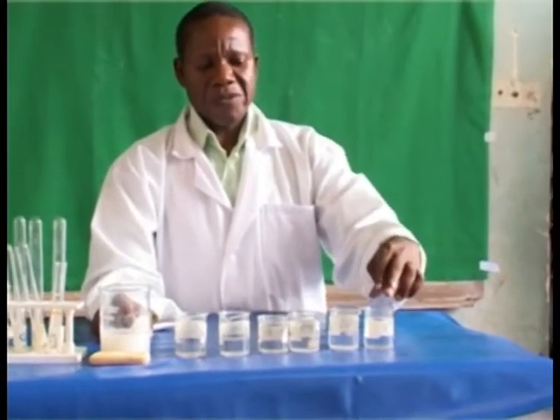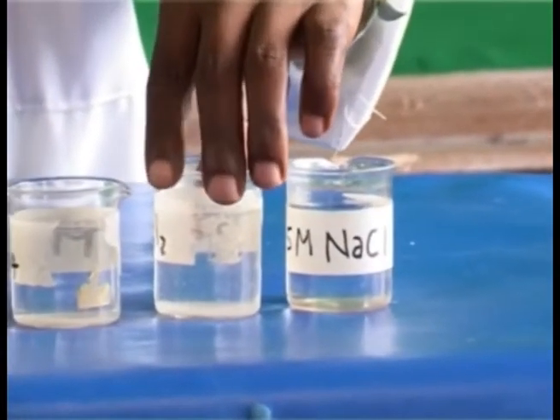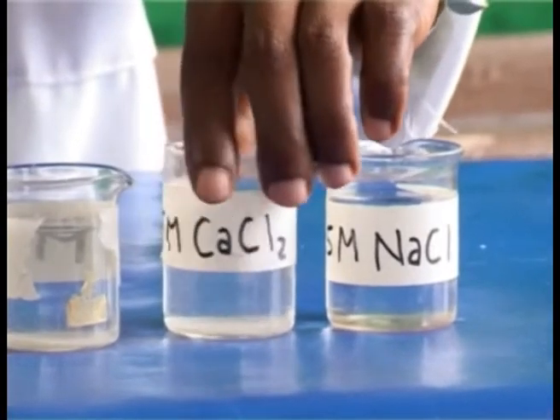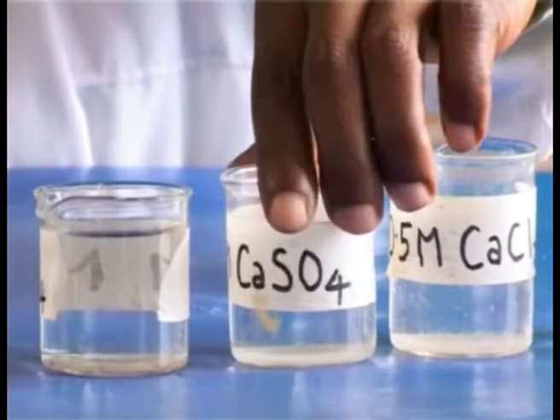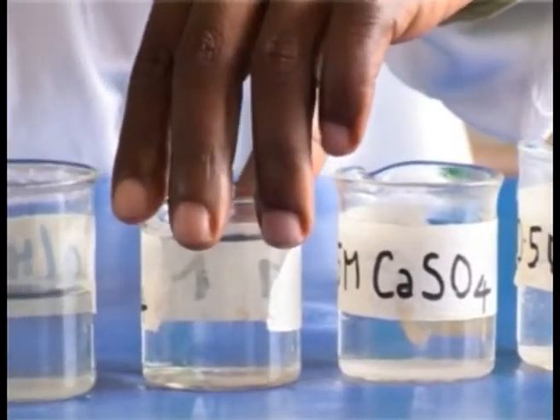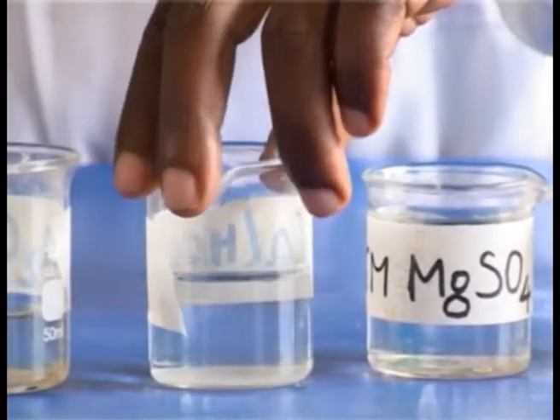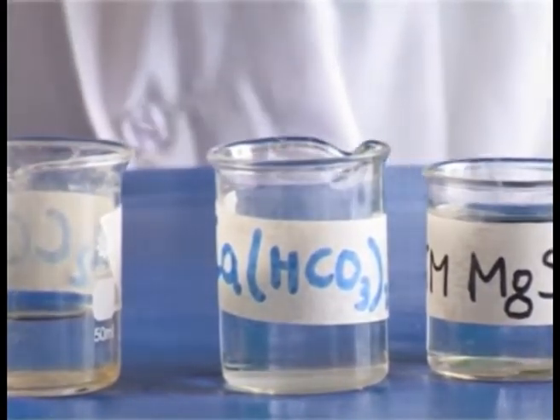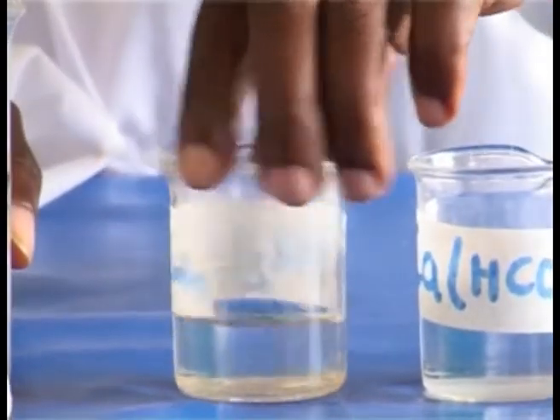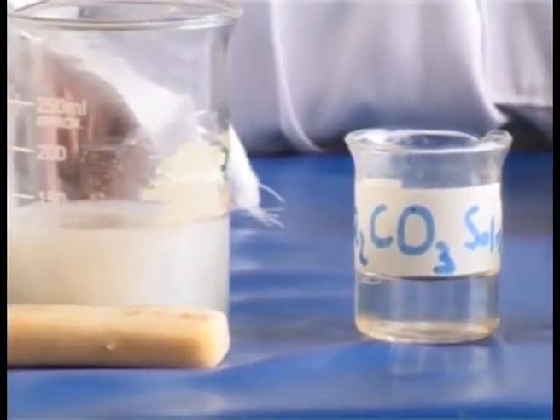In this experiment, we shall use these chemicals: 0.5 molar sodium chloride, 0.5 molar calcium chloride, 0.5 molar calcium sulfate, 0.5 molar magnesium sulfate, 0.5 molar calcium hydrogen carbonate, 0.5 molar sodium carbonate, and soap solution.